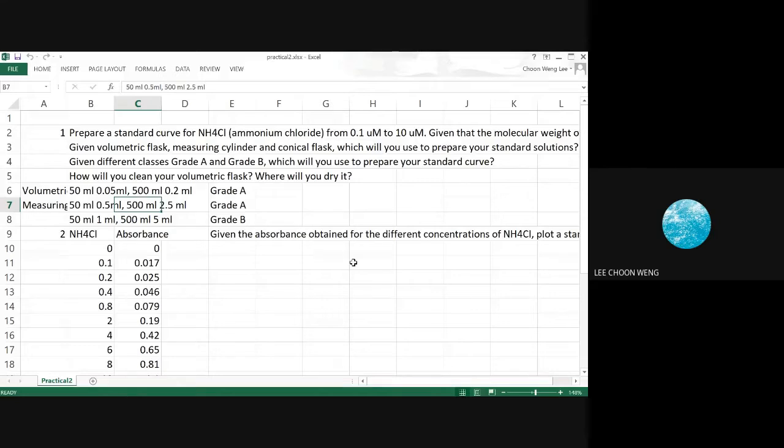So we're talking about spectrophotometric determination. Definitely, we need a spectrophotometer. When you have a spectrophotometer, you need to know the range of wavelength that it can measure. Not all spectrophotometers are the same. It depends on whether they have the deuterium or the mercury lamp that allows it to extend its range beyond the visible wavelength into the UV wavelength.